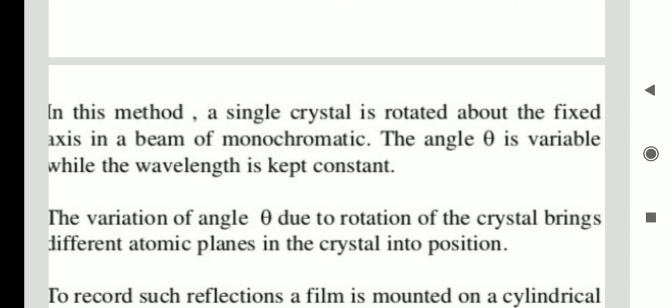So the variation of angle theta due to the rotation of the crystal brings different atomic planes in the crystal into position.